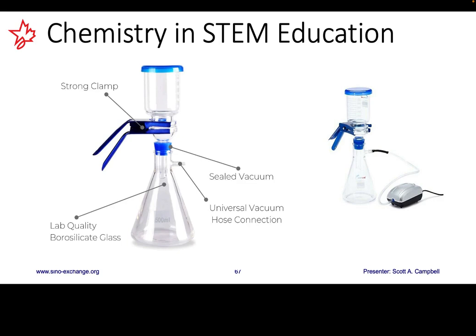With the scraps thoroughly washed, you'll now be ready to filter the blackened acid to catch any fine particulates that are still remaining in solution. Pour the solution into a funnel with a filter, or better yet, use a vacuum filtration unit. Also, be sure to pre-wet the filter for optimal results. Once the entire solution has been filtered, you should be left with large gold particulates in the beaker and some finer gold particulates that have been caught in the filter.